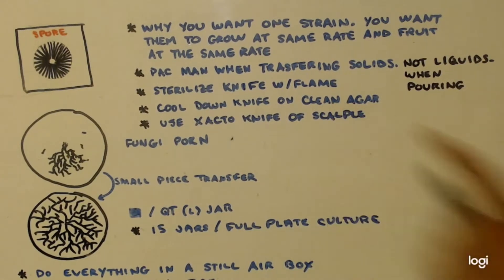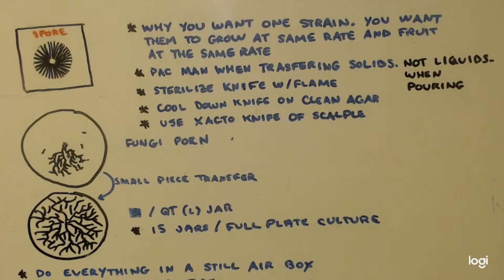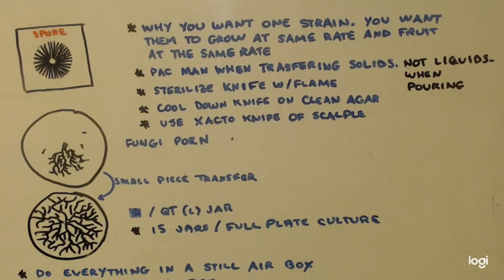Another thing: you have a knife that you use. You always sterilize it with a flame. The way you cool it down is — let's say I'm getting a sample out to put somewhere — I'd heat it up with a flame until it was red hot, then dip it into the agar where it was clean. That would cool it down, and then I would make my cut. You should use an X-Acto knife or a scalpel, but you can really use any knife as long as you can sterilize it.